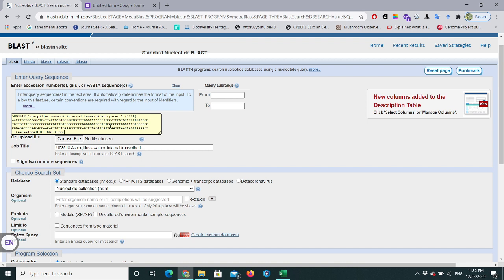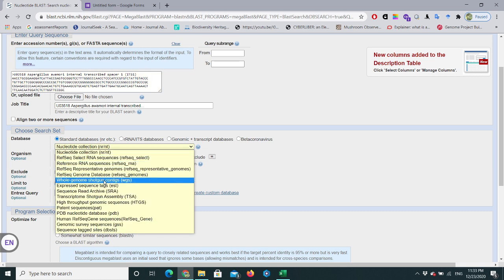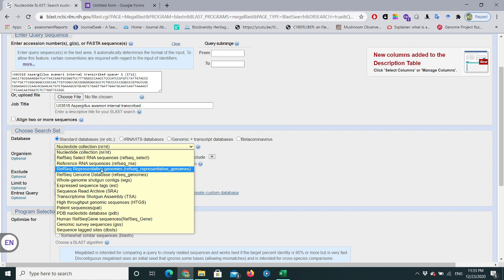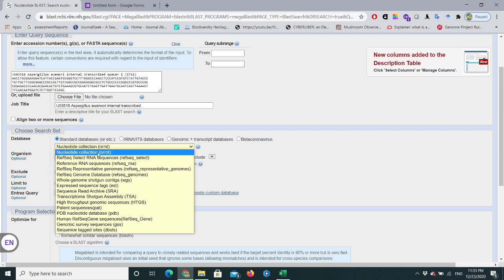This is the first step — you need to upload your sequence in the correct format that NCBI accepts. Below that, you can see 'Choose Search Set', where we need to select a database. For all nucleotide sequences in NCBI, we have a standard database search engine. You can see different databases listed, and these different databases are used for different purposes. Generally, if you want to find similarities between DNA sequences, you need to select 'Nucleotide Collection'.